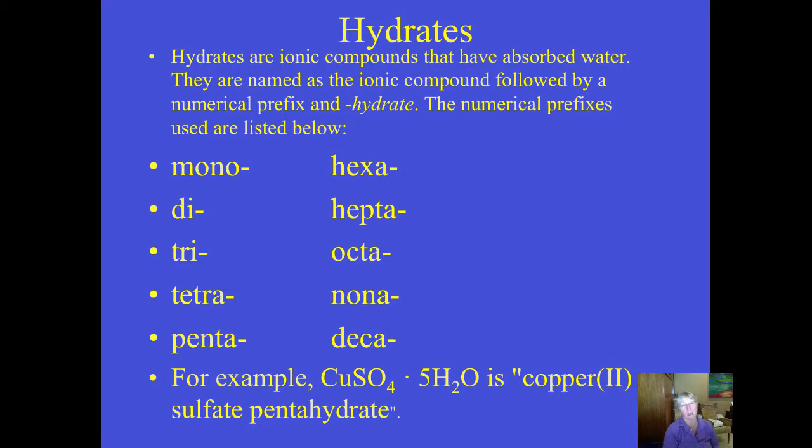And your goal today will be to determine the number of waters that are attached to a hydrate that you and your lab partner will be assigned.